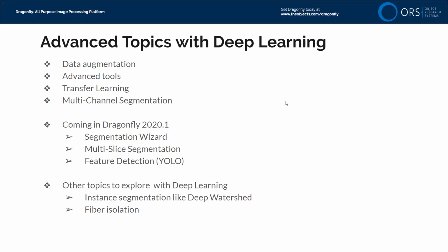I think we'll also have within 1 to 2 years the ability to recognize cracks in samples, and it won't matter what the conditions are. In fact, there's already been a paper published on this where people took photographs of ceramic tiles under all sorts of different conditions and lighting conditions, but you had diverse training data going into the network, and so it did a very good job of recognizing cracks in test and validation data sets.